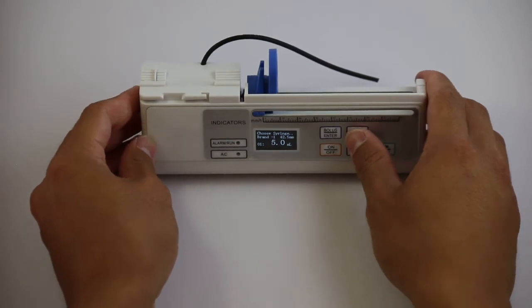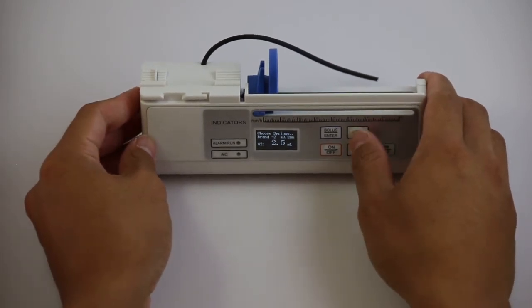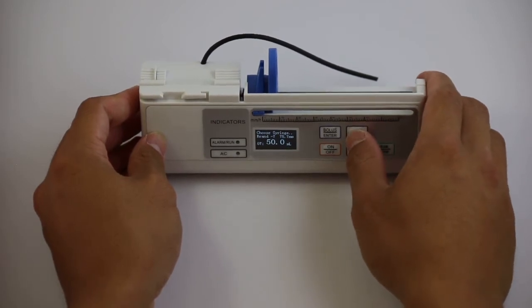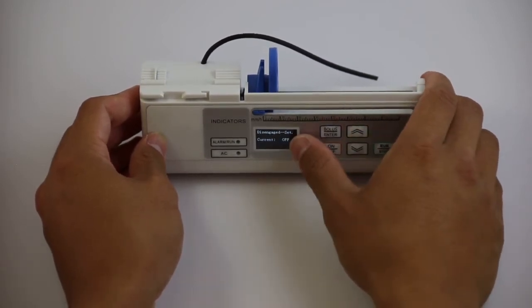Repeat as necessary to calibrate the various syringes. Once you've completed your calibration, you can then continue to modify other settings. Let's now go through the other settings that can be changed.